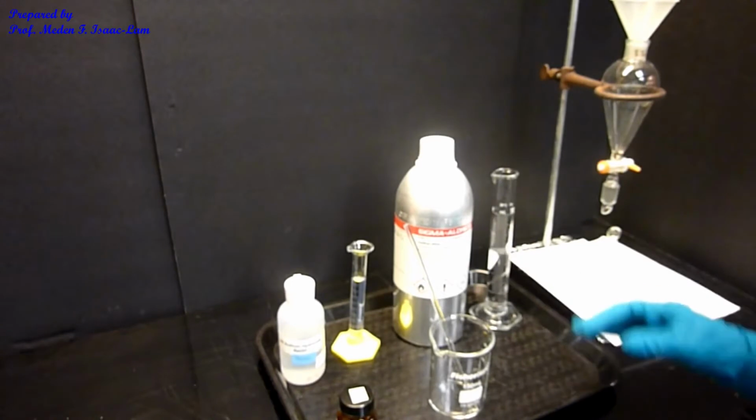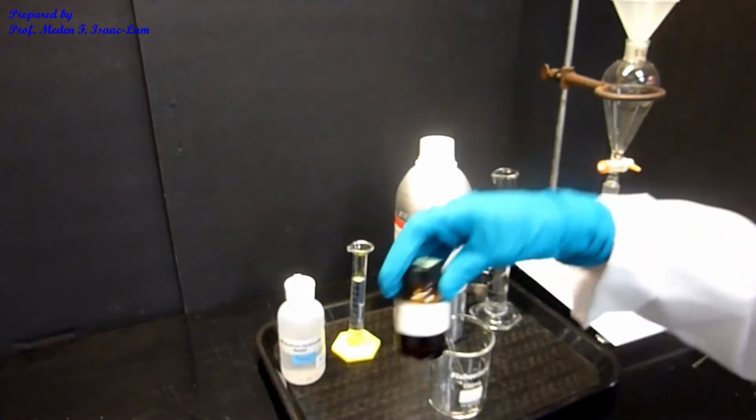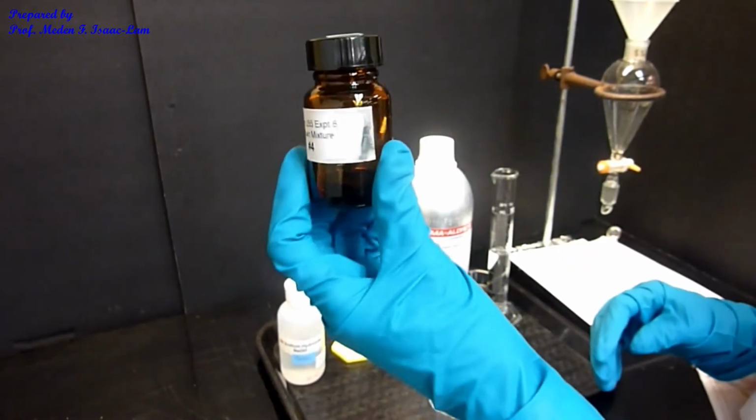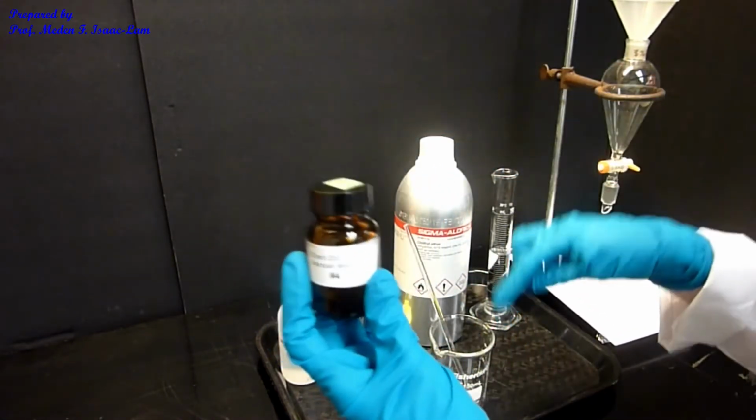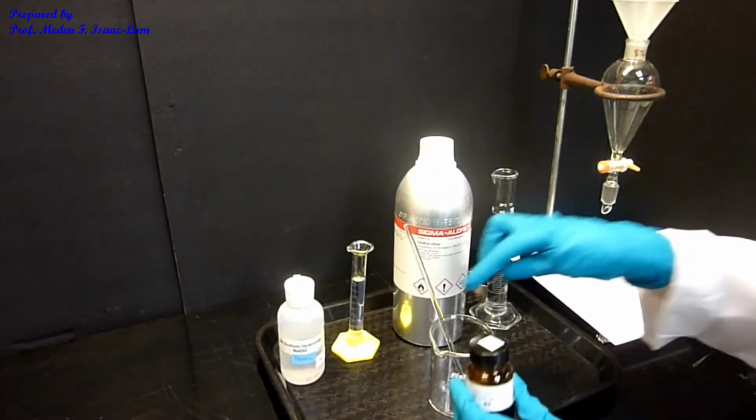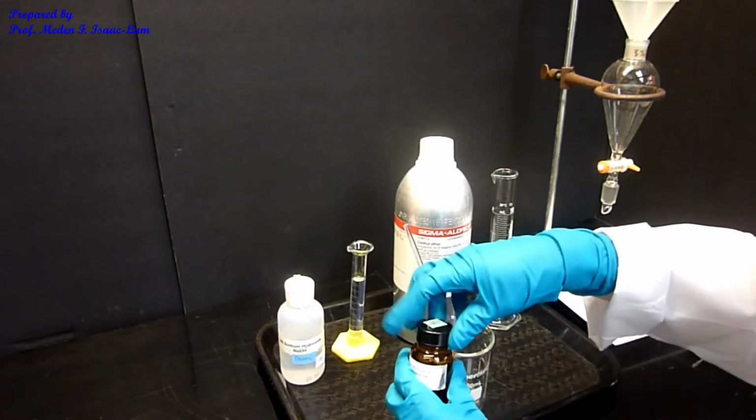So now I'm going to pour the mixture into the beaker, and I also have a stirring rod.